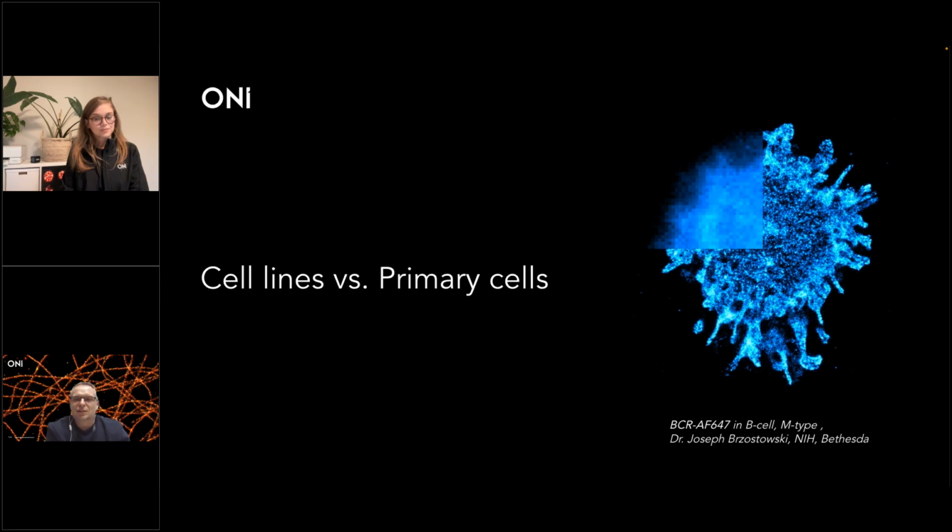In terms of single molecule localization microscopy, you are using special buffers which contain, for example, glucose oxidase. The whole role of the glucose oxidase is to get rid of the oxygen, which is causing the photobleaching. So if you use something like STORM, where you have a fluorophore attached to a primary or secondary antibody, you will need to use some of these buffers with glucose oxidase. I could also recommend using those in confocal imaging because they can help you have less photobleaching, so you can image longer. But please don't use them in live cells because they are very harsh for live cells.